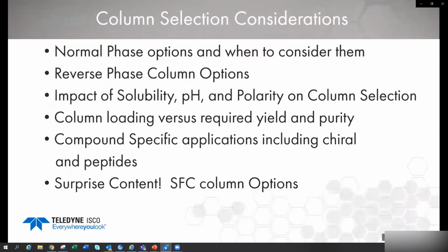Next, I'm going to get into the topics for today. I'm going to go a little bit into the normal phase options and when to consider those, and reverse phase column options, including some of the factors that affect reverse phase, such as solubility, pH, and polarity in your column selection. Column loading is in here, as well as a little bit of special applications using chiral and peptide molecules. And as a teaser, I had put in there that we were going to have some surprise content. Today's surprise content is going to be SFC column options, which there are quite a few of, but I'll just give you a few quick points for those as well.